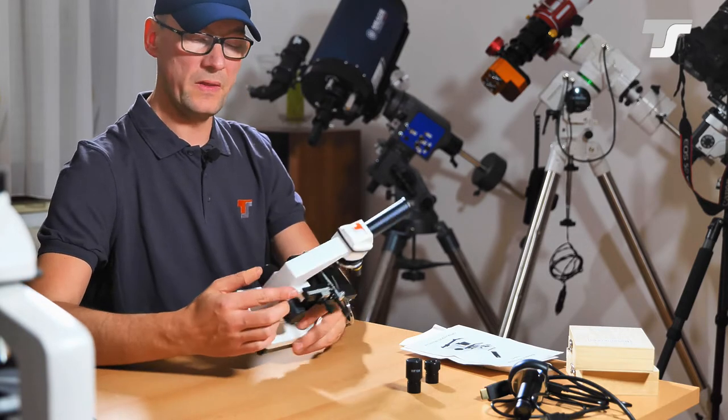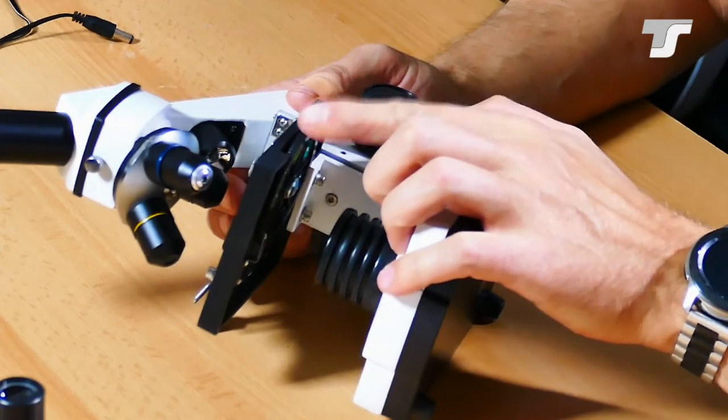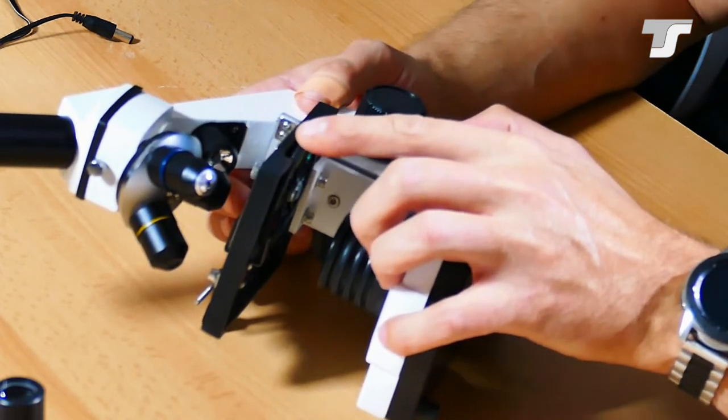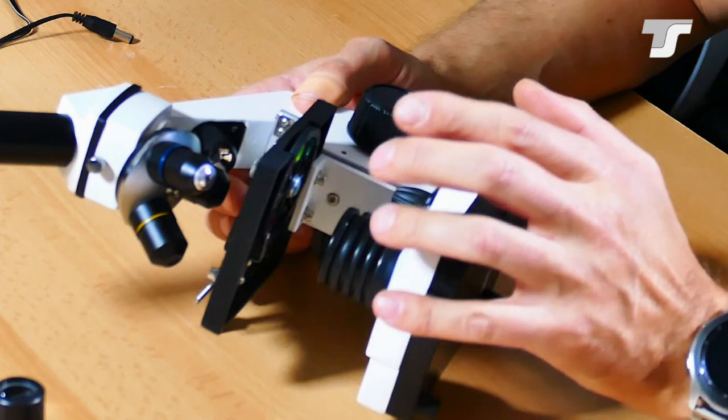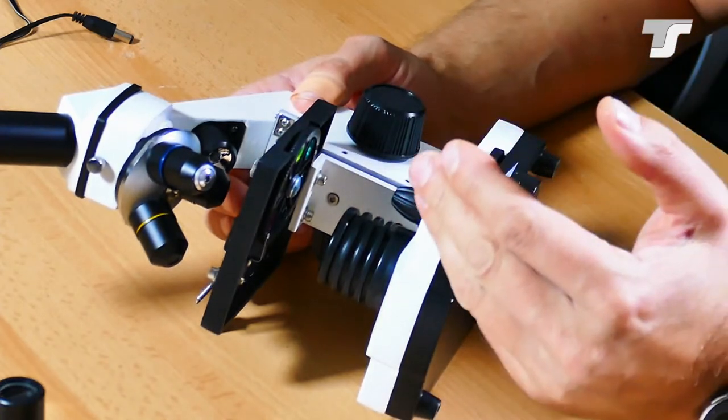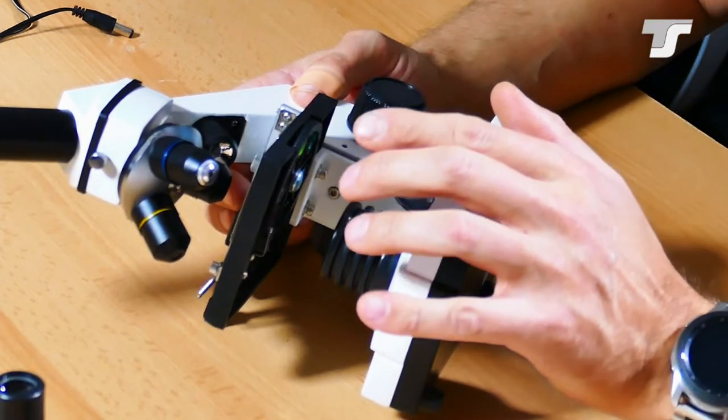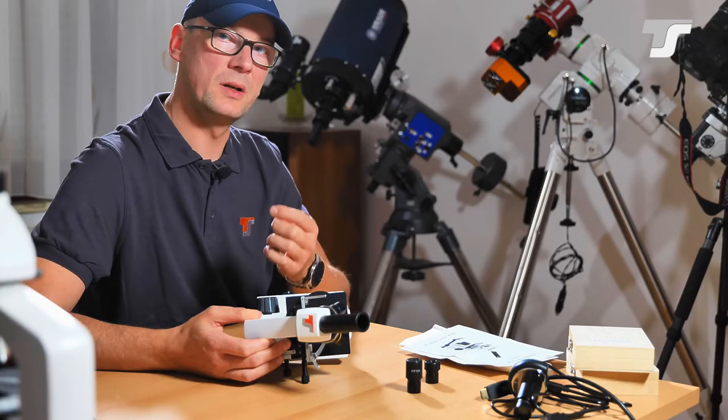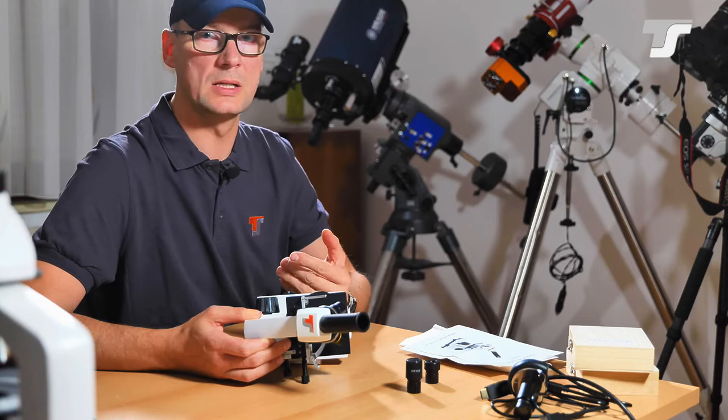Last but not least, there's one feature left. And this is below the table. Below the table, there is a filter wheel integrated. A six position filter wheel with one empty position. And then there are some color filters integrated. So you can match your subject to the perfect color to get the most contrast out of your subject.